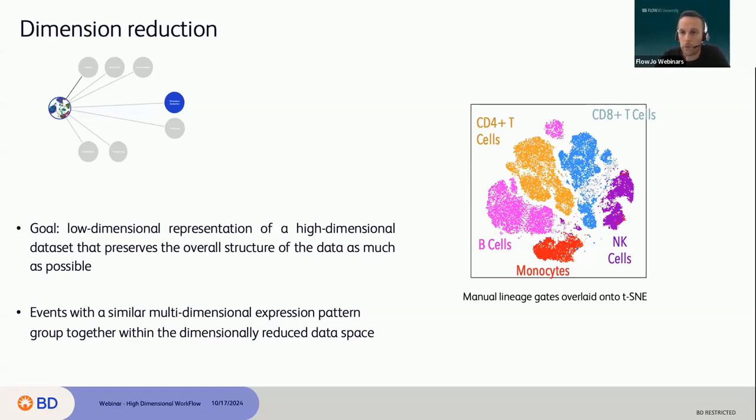FlowClean was the first algorithm that was released, in 2016. It really was a good first step in the progress of cleaning our samples. Now it is, in my opinion, outdated compared to the other ones. So I will put FlowClean a little bit on the side. If you used FlowClean in the previous data analysis and it is a longitudinal study, keep using FlowClean because that way you're consistent in your analysis. But if you're starting new today, just probably pick another one.